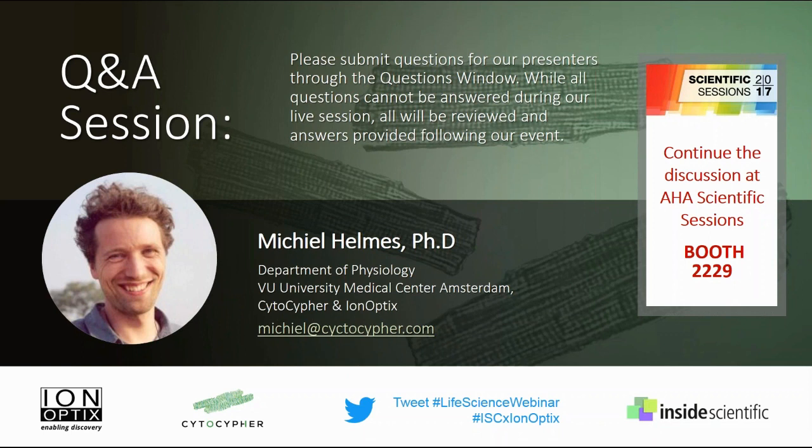That's a wide-ranging question. I think a lot of improvement has been made over the past years with good protocols that are also relatively straightforward for others to follow. The advent of Liberase has greatly improved things, but there are also very good collagenase type 2 protocols around. Cell culture has also been improved. On the second day after isolation, the contractility and the appearance of the myocytes is about as good as on day one.